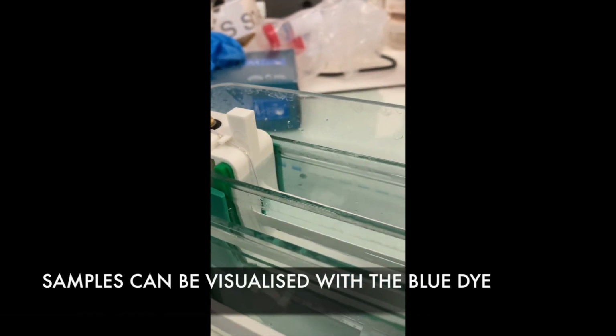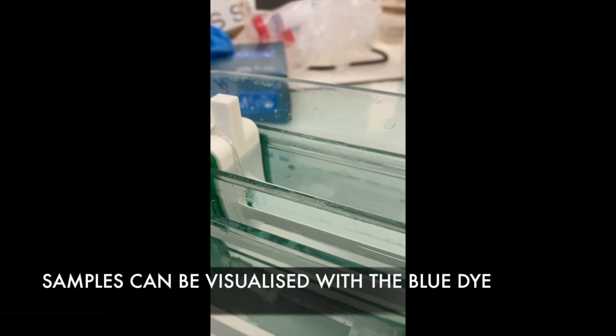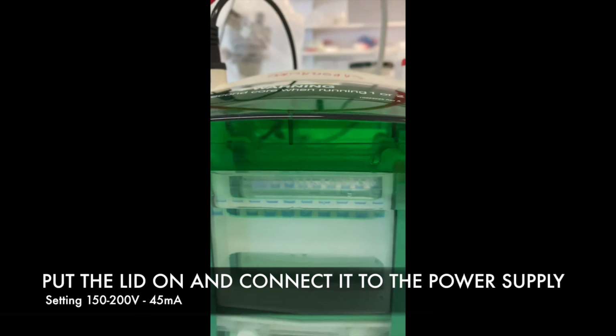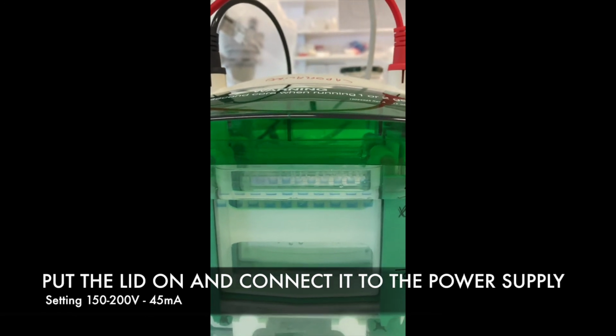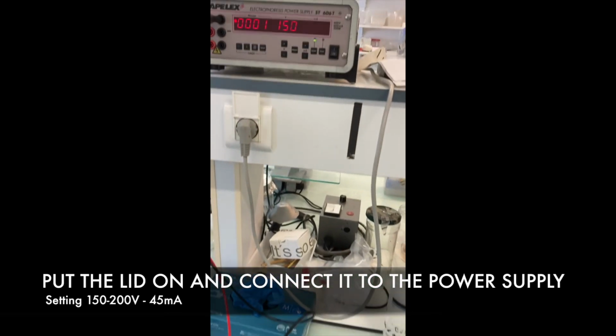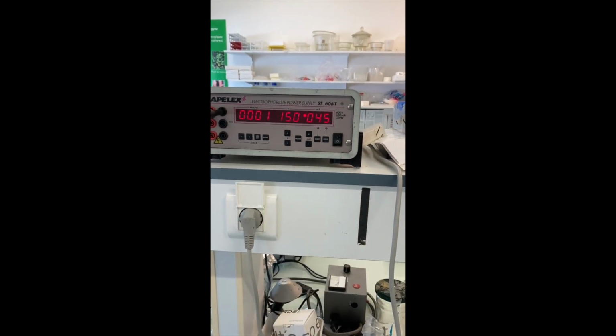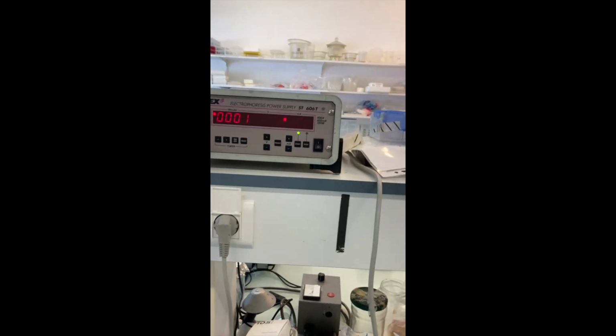Here you can follow the different samples in blue in the wells. Once all the samples and control have been loaded, put the lid on the tank in place and connect it to the power supply with the following settings. For example, 200 volts and 45 mA. This can be adjusted according to the concentration of acrylamide used or the speed of migration desired.